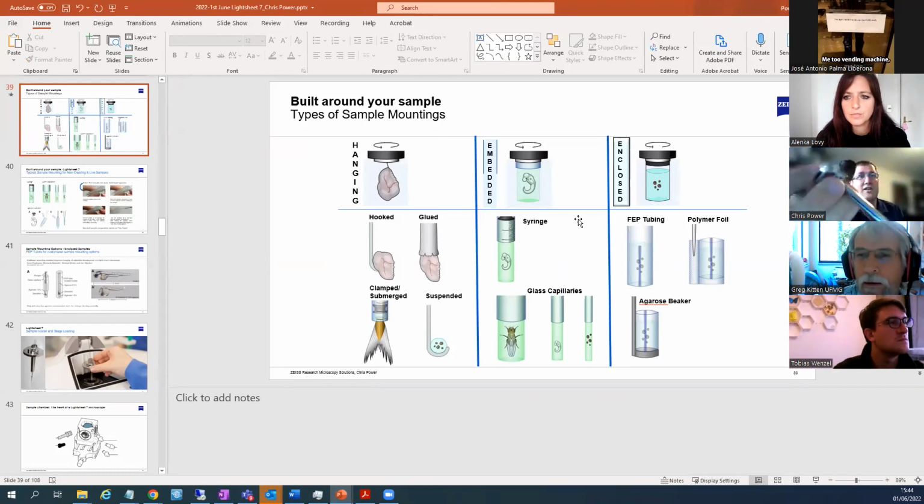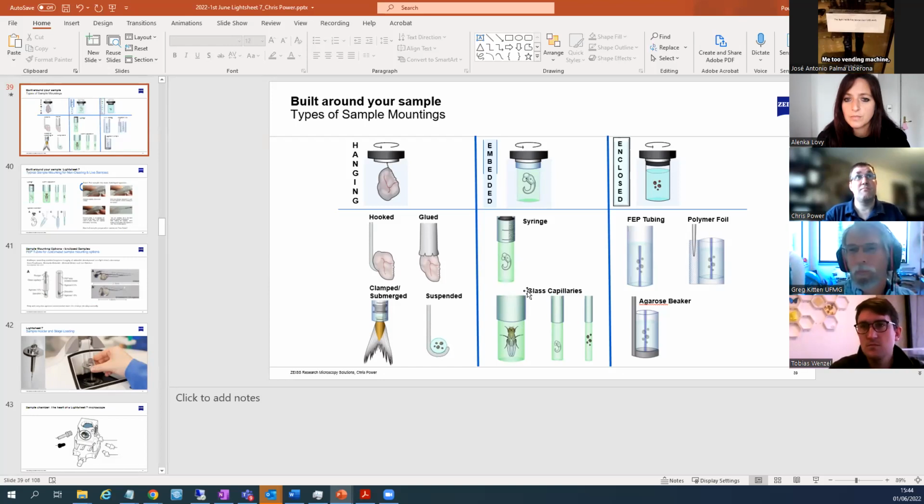Is a metal stick like this. Okay. In that, when you get the system, you get a bunch of glass capillaries and sponges and wires. That lets you do this technique really easily, the embedding technique. And those capillaries cost about 10 cents each, and the plungers you reuse.